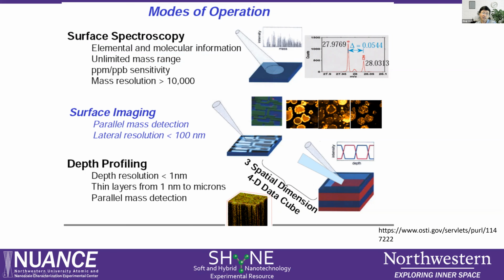This image, like an elemental image, of course, you know the EDX, you can do the mapping, but you cannot do light elements, only the heavy elements. So this one you can do all the elements. And XPS is quite useful, but XPS cannot do the mapping. So the unique point of SIMS is that it can see the distribution of the elements at quite high resolution like this.